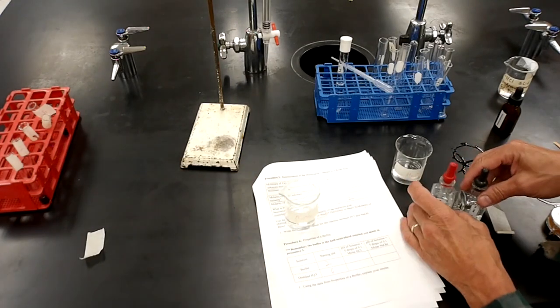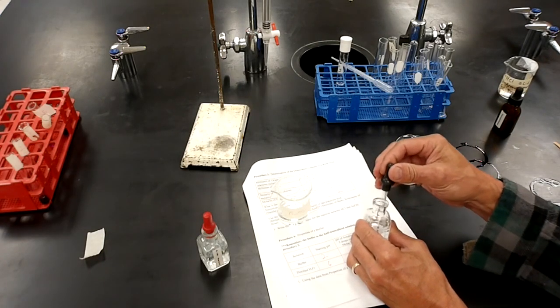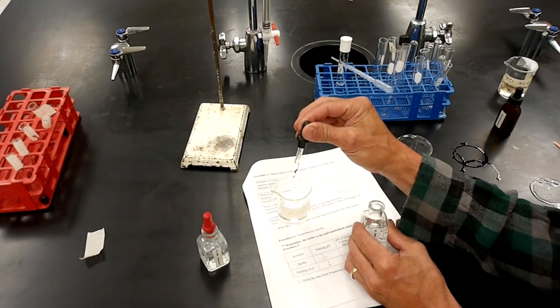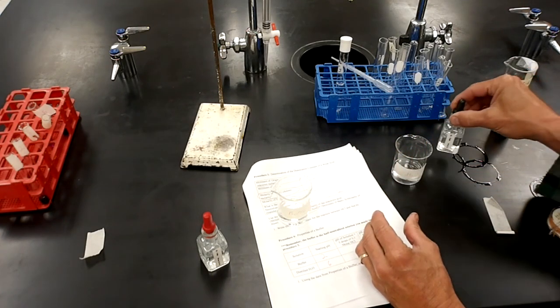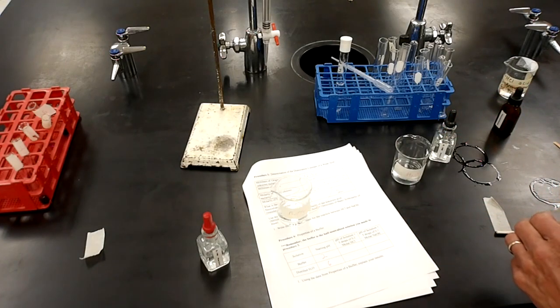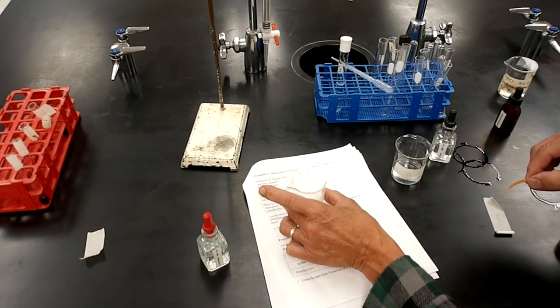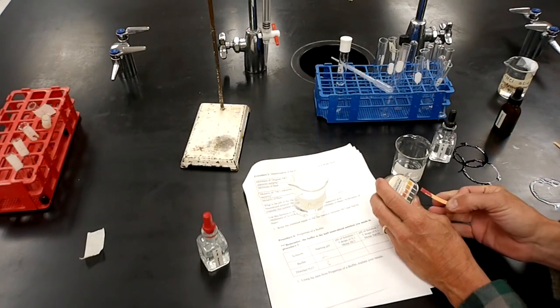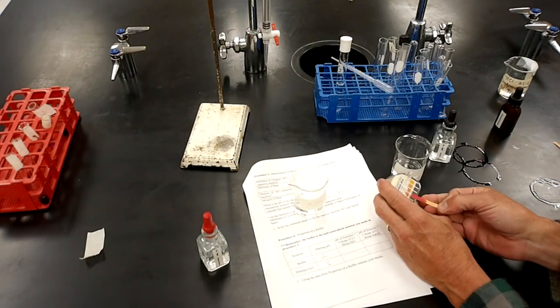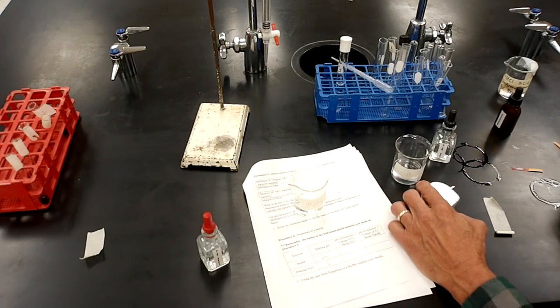There's the buffer. Hydrochloric acid, so we've got a pH of 2, and I'm going to add 5 drops of this acid. 1, 2, 3, 4, 5. Mix it around a bit. Measure its pH. And I could call it a pH of 1. It's fairly acidic.